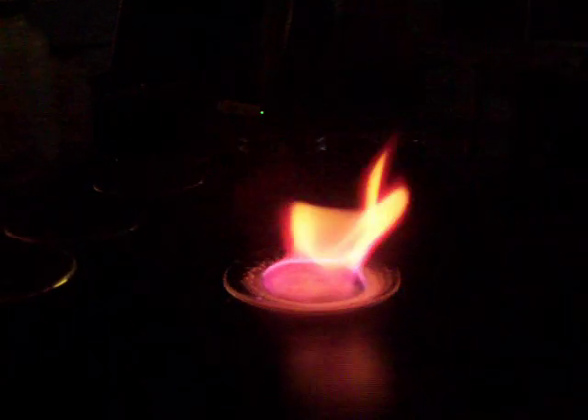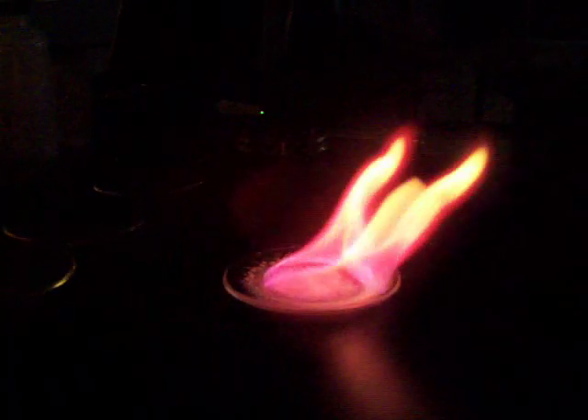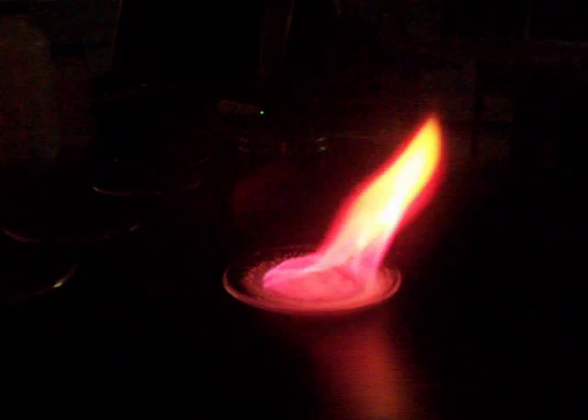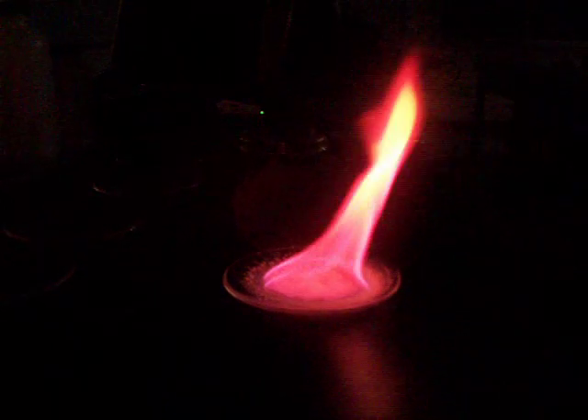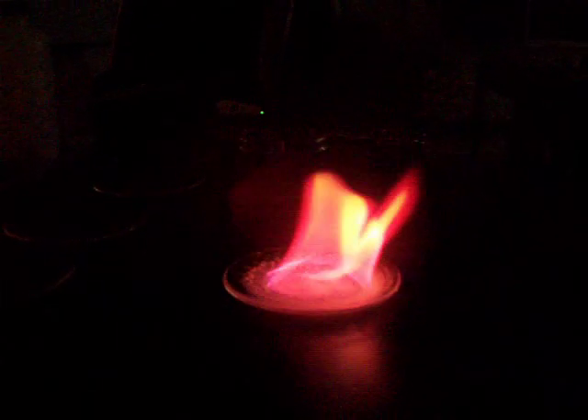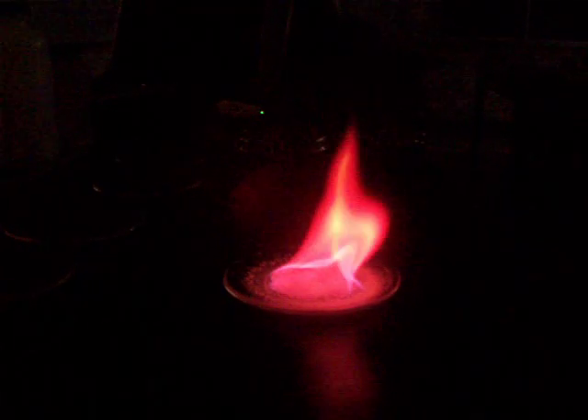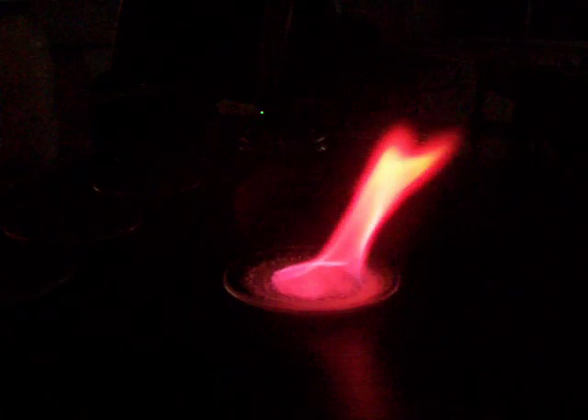This is actually one of my favorites — it's a shame to do it first, but I'm trying to follow the order of the periodic table today. This is one of my favorite colors of all of these. There's also cesium, which I couldn't do here with the alcohol because it burns a very pretty sky blue color. I've only seen pictures of it; I've never been able to do the cesium on my own.